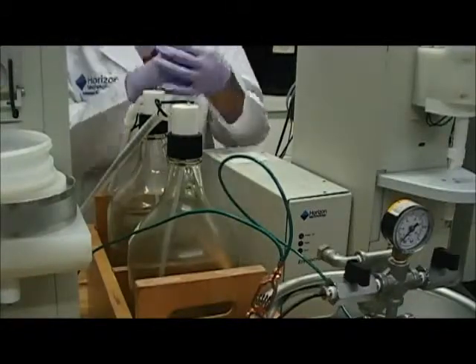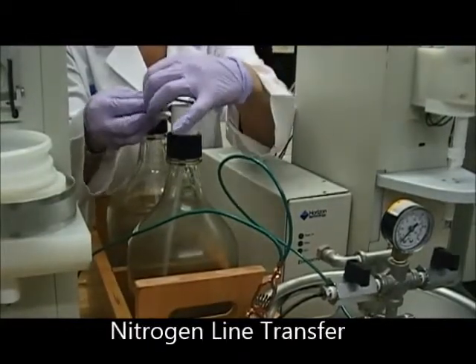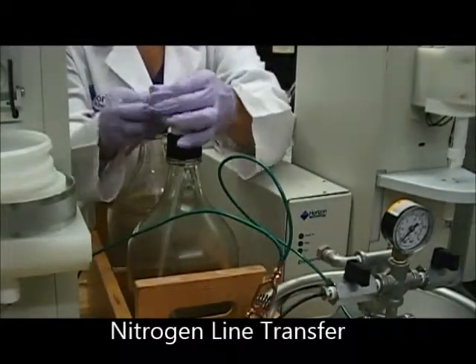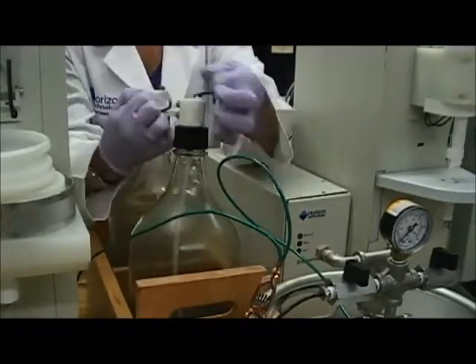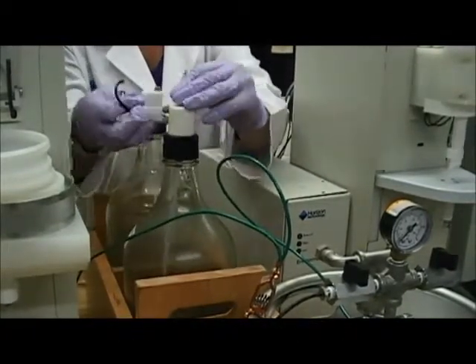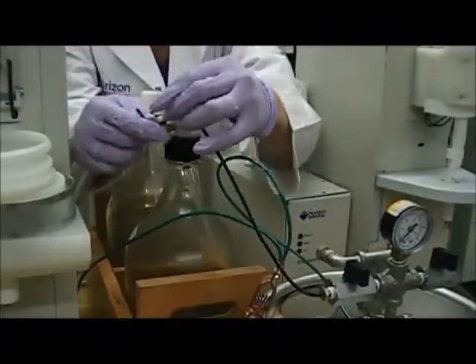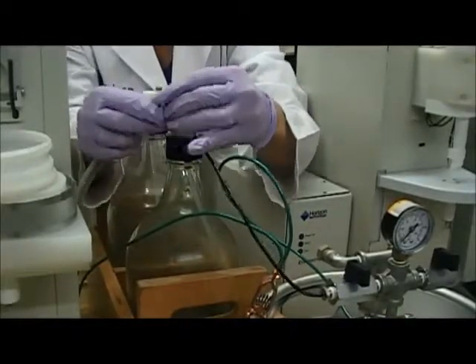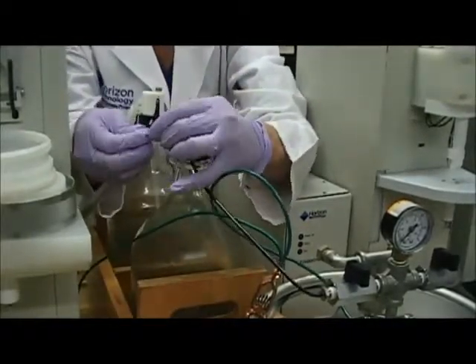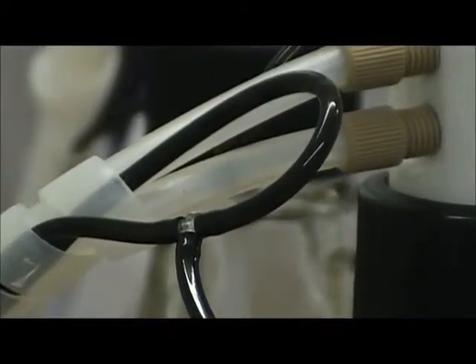Next, we're going to change the nitrogen lines over to the new solvent delivery system. Loosen the lines on the plastic coated solvent bottle — it's the small, black gas line. Then take the attached gas line from the solvent delivery system and put each end into the lines that are on the other bottle. It will look like this.